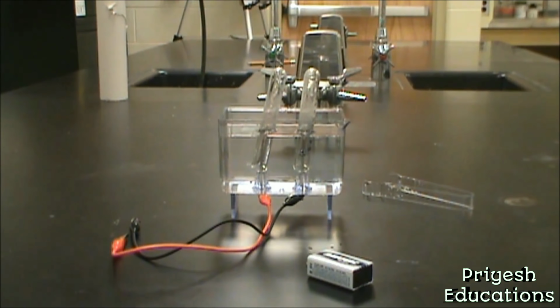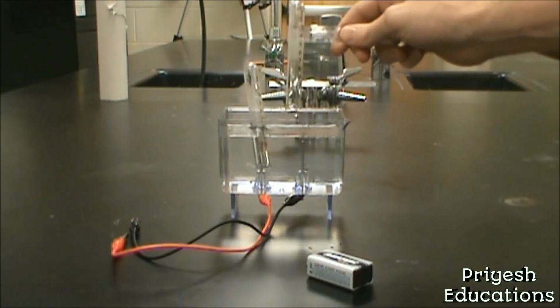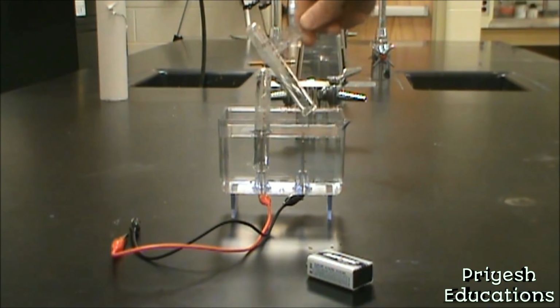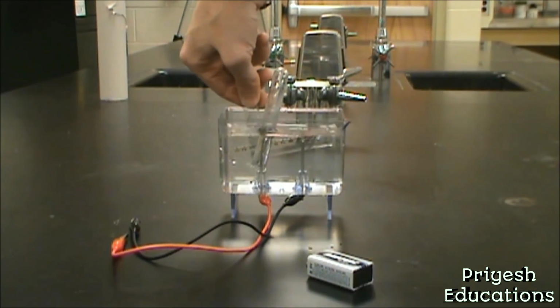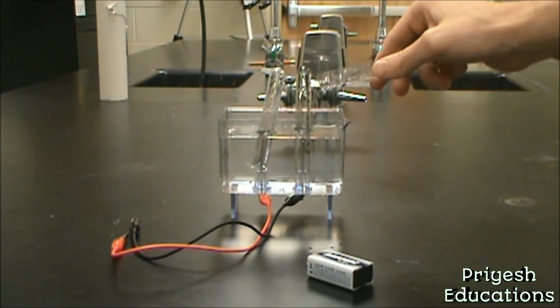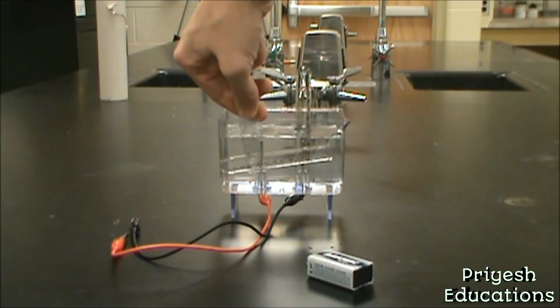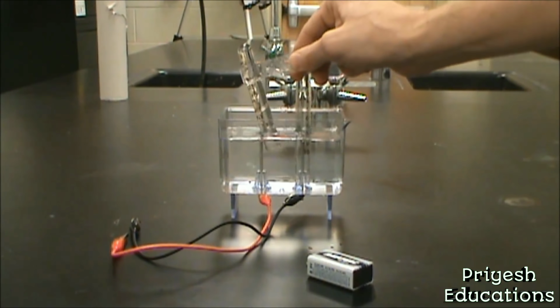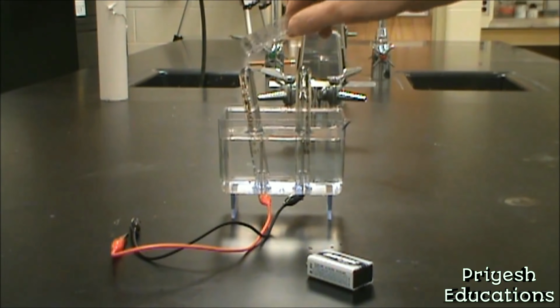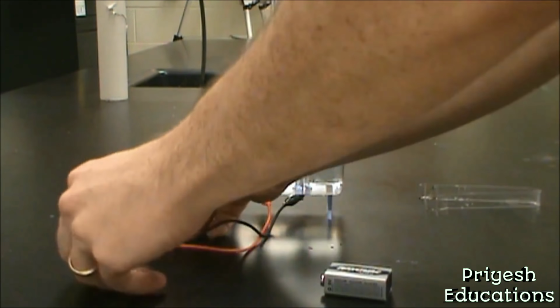I'm going to show you an electrolysis of water setup. So we have a mini Hoffman apparatus, and I'm going to take this little test tube here, and I'm going to dip it under and fill it completely with a 3 molar sodium hydroxide solution. I'm going to do the same with this one. Since we're starting with that completely filled up with solution all the way to the top here, it's going to allow us to collect gases in each of those.